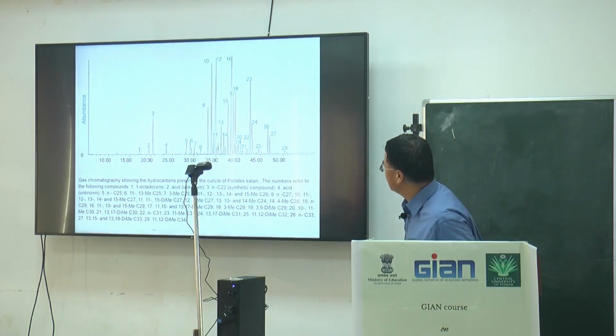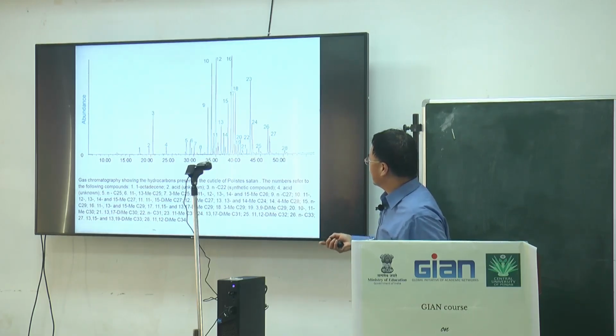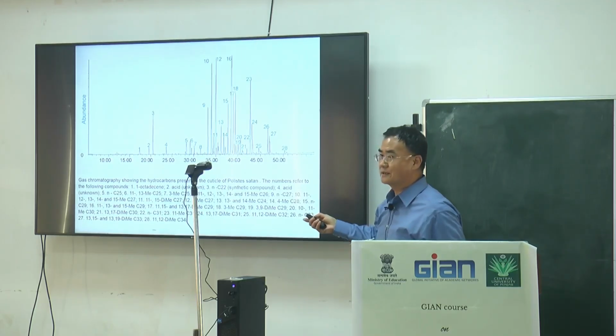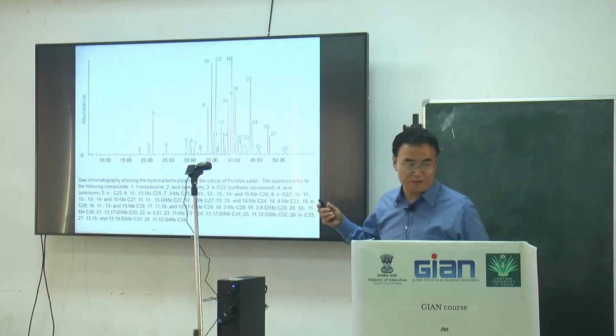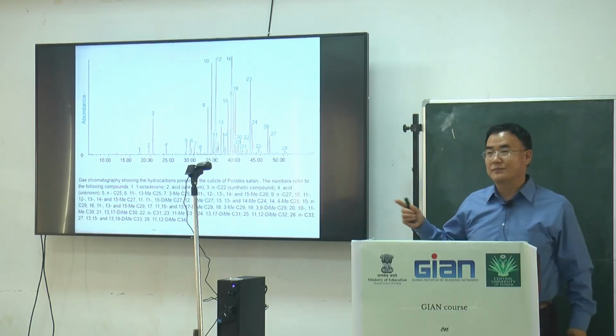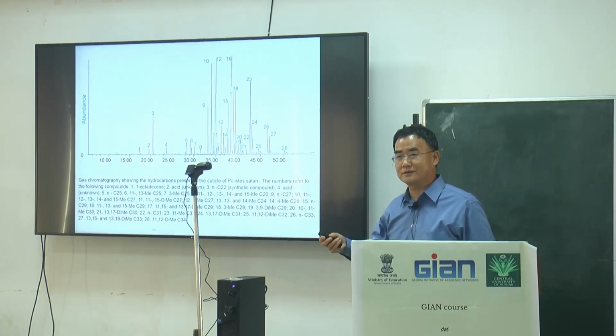And this uses the gas chromatograph to show the hydrocarbons. Yeah, methylated lipid.